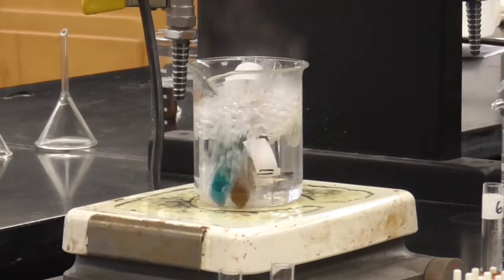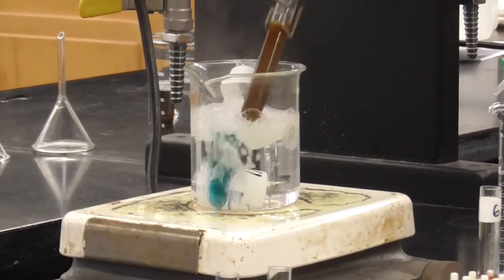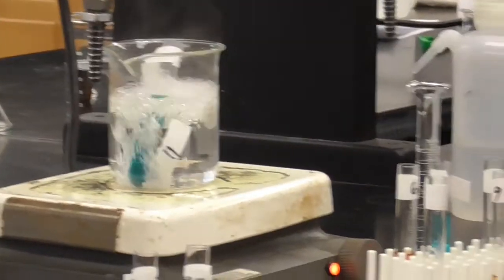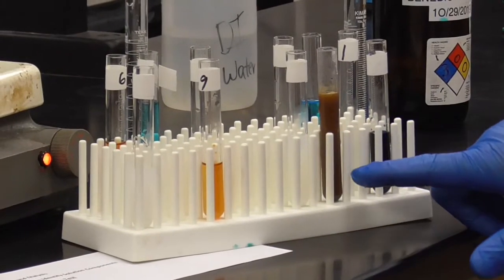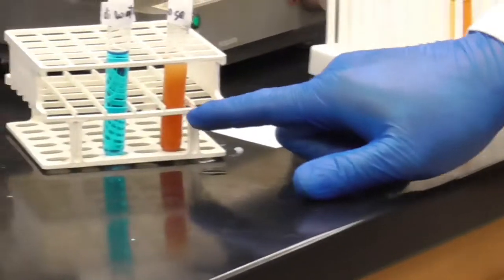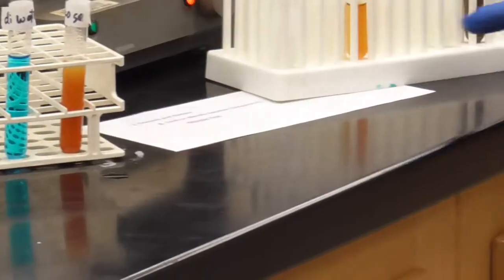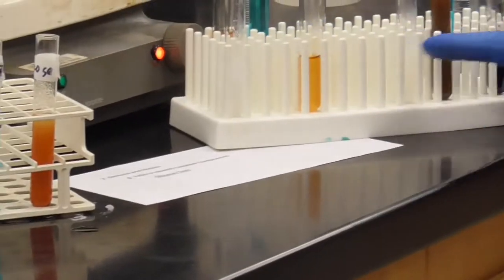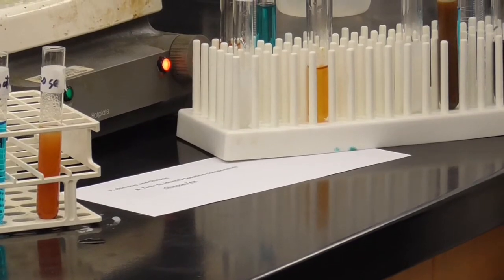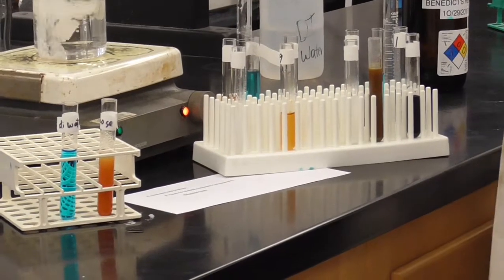Okay, so it's been heating for 5 minutes. Let's go ahead and take a look. This one is from the inside of the bag, and definitely a positive test for glucose. Remember, over here, that's the negative, that's the positive. And it's been heating for a long time, so it actually went beyond that orange color and turned out to really brown. Here's the one from the outside of the bag after 30 minutes.